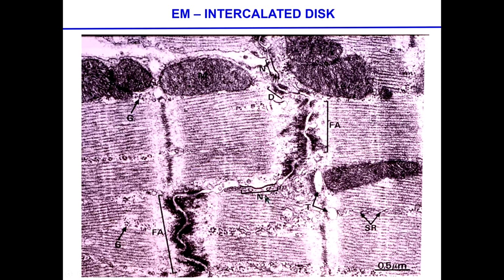All right, in the horizontal positions, wherever there is an N, is a gap junction, and these other portions in here, which are actually also present at high density in this other location, where it says D is actually desmosomes, and these are mitochondria, and the SR is sarcoplasmic reticulum. Okay. I'm sorry, questions? Where is G? Oh, this is, remember that the regions where glycogen is accumulating? Okay, sorry about that.